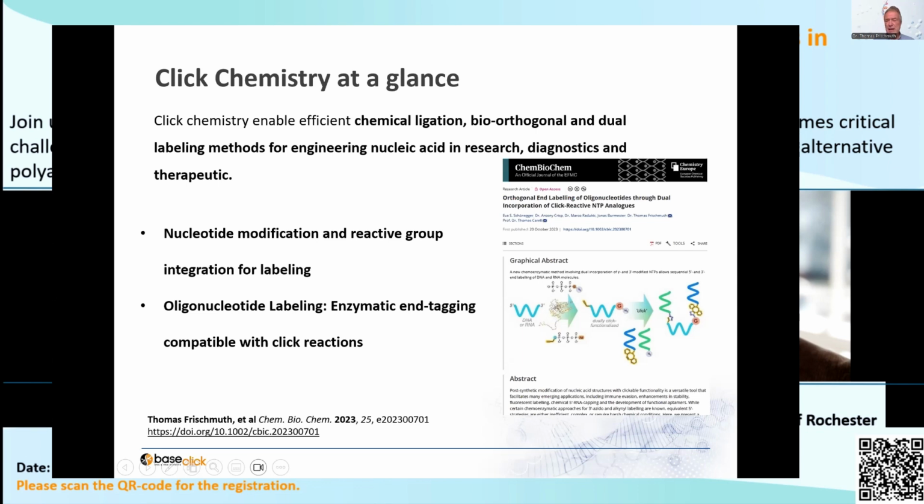And, important for the ClickSeq technology, you can also link oligomeric nucleic acids with other oligonucleic acids, either by a SPAAC reaction or in the copper-mediated reaction.